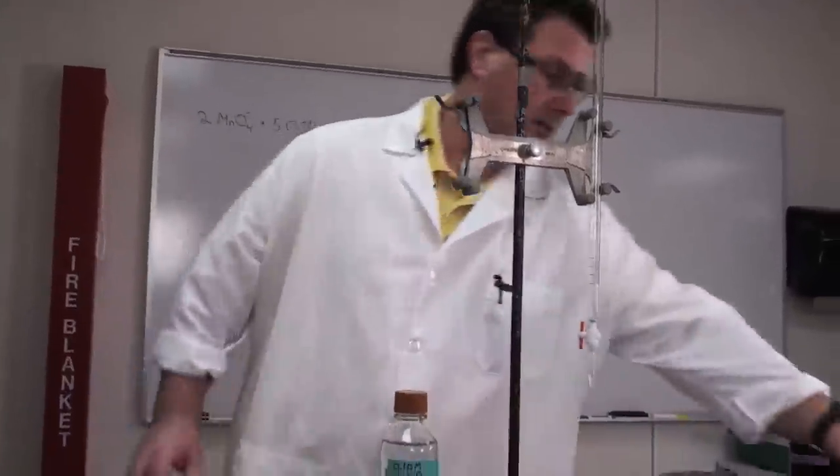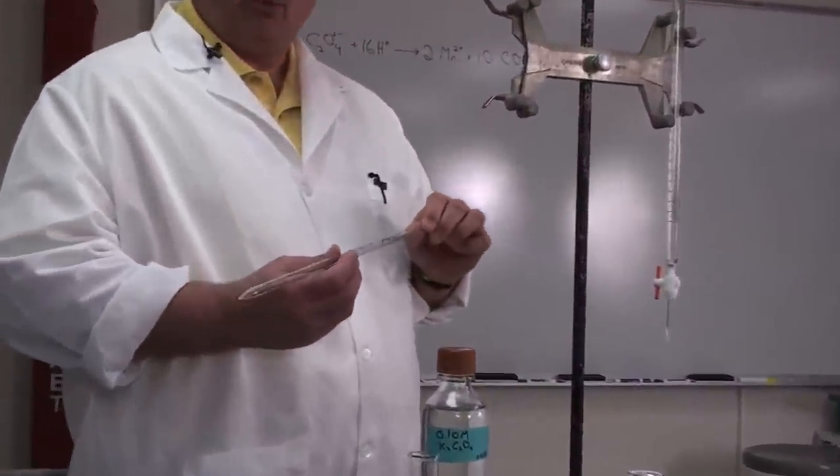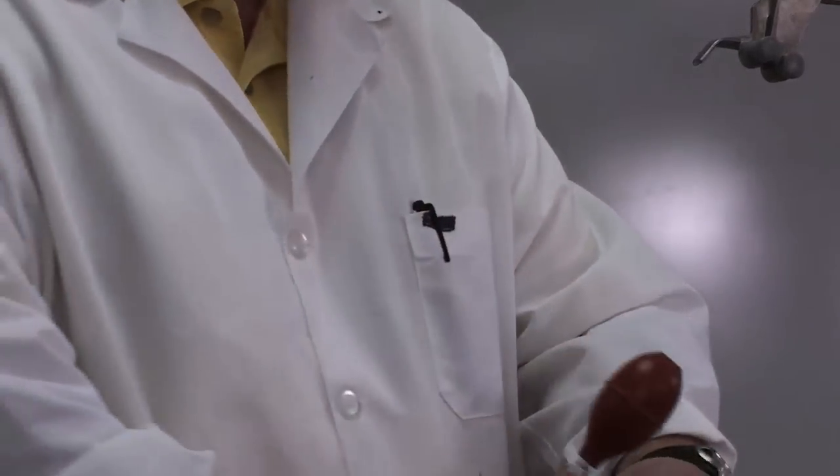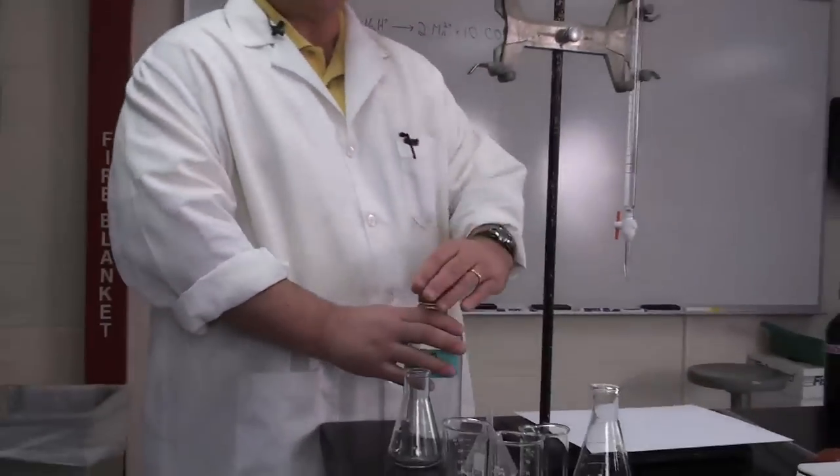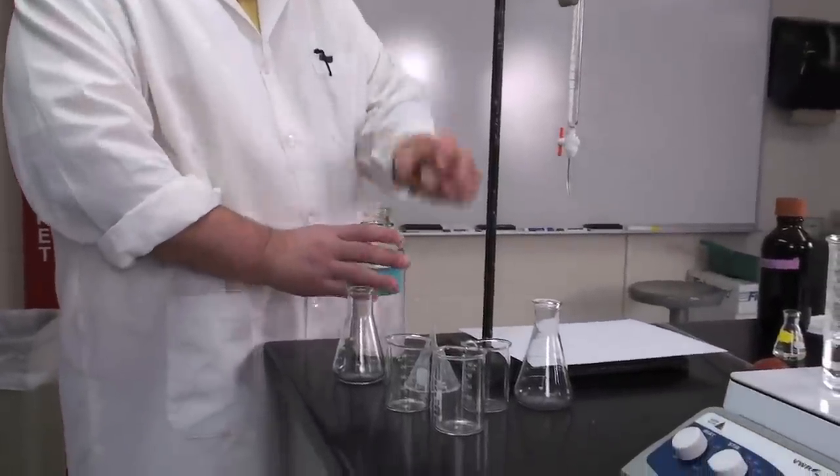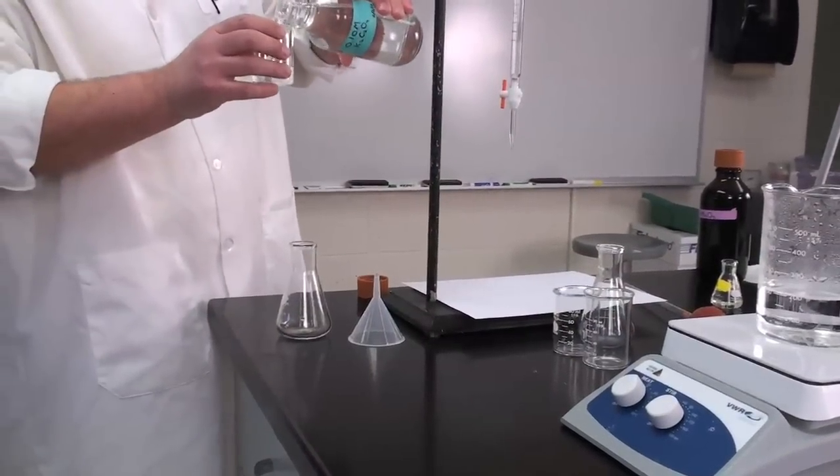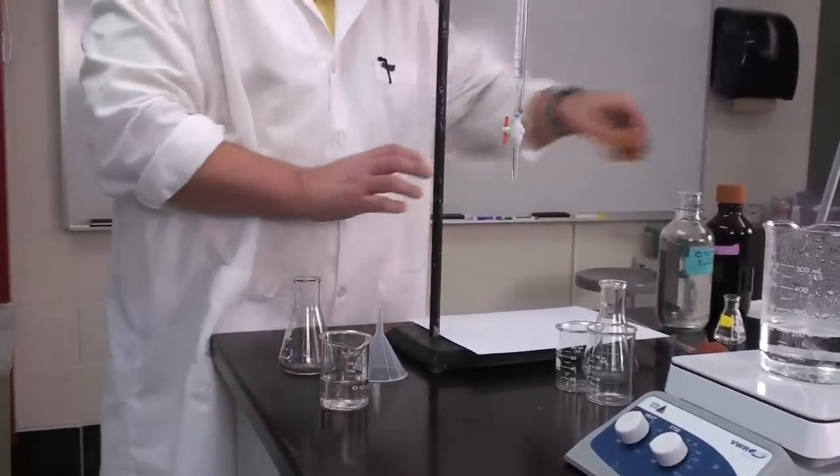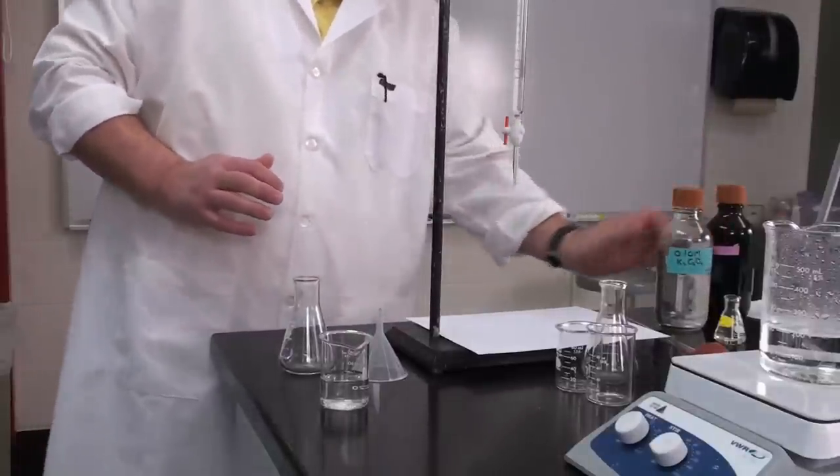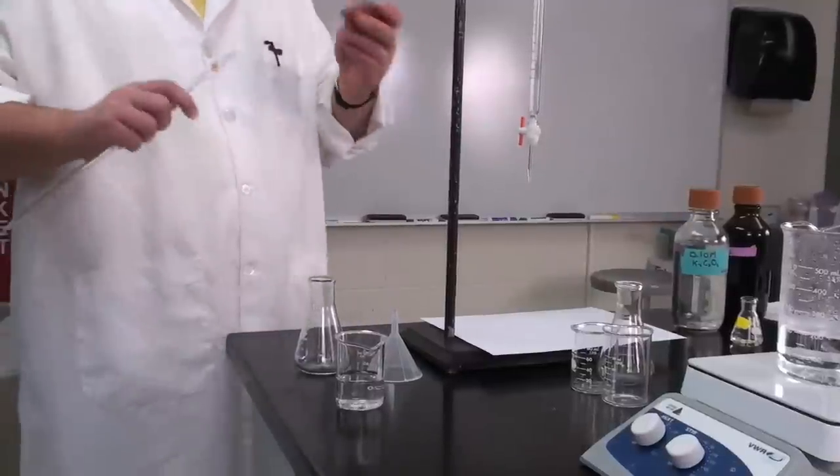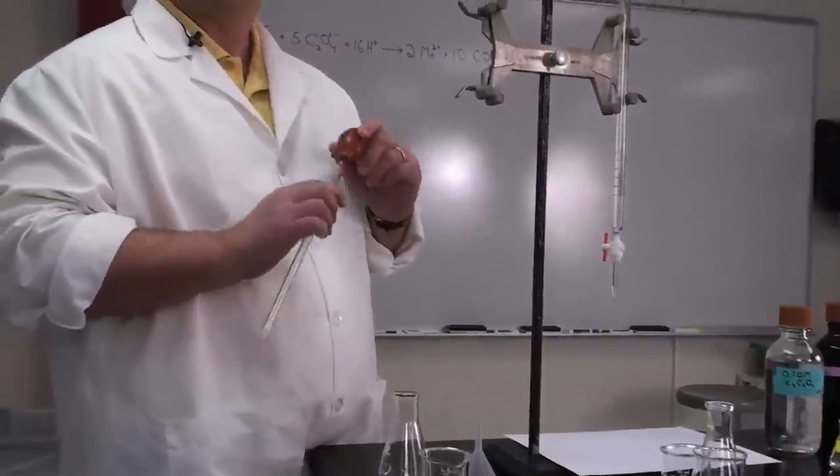I'm going to do that using this graduated pipette. You've done some pipetting before, but it's always good to review pipetting technique. My preference is to use one of these pipette bulbs to draw the solution up into the pipette. I'm going to take some of my oxalate solution, and we never want to stick any device into our stock bottle. So I'm going to pour it into a separate flask.